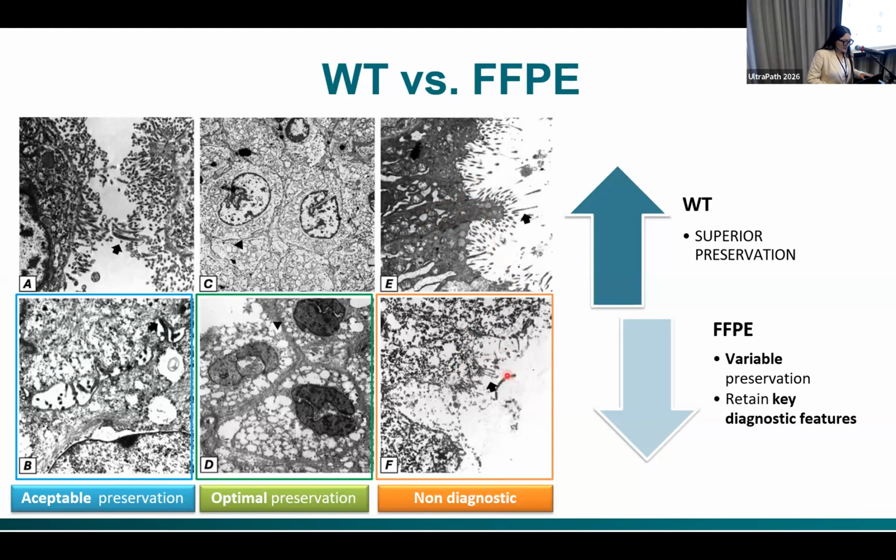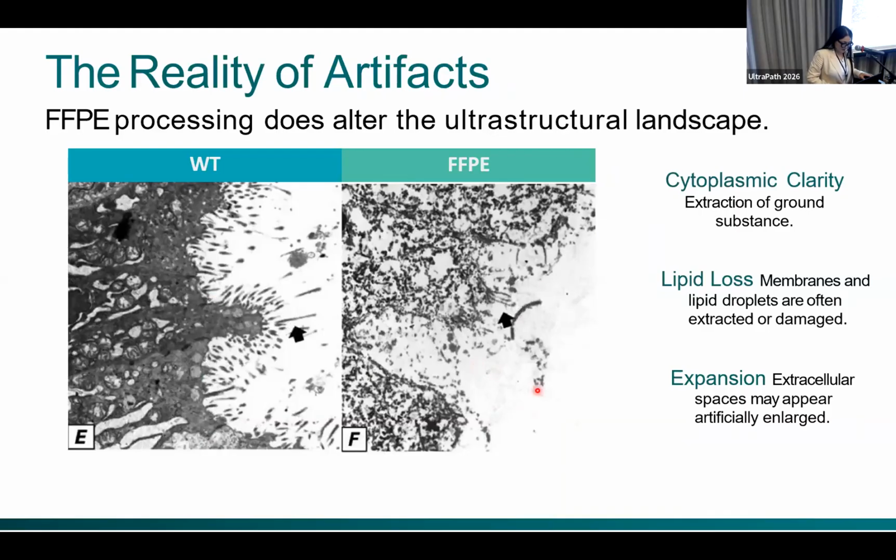We can maybe only see some cilia here, but the artifacts are more prominent. So the artifacts are undeniable in the FFPE specimens.